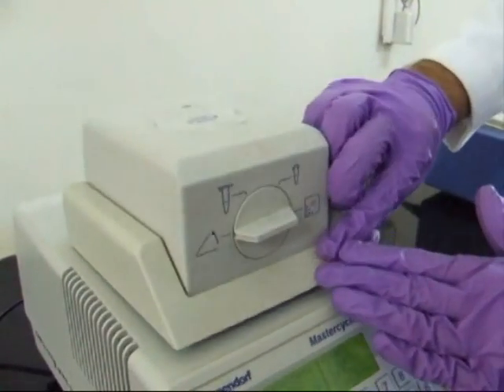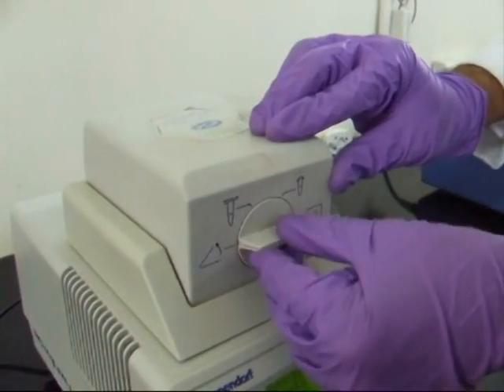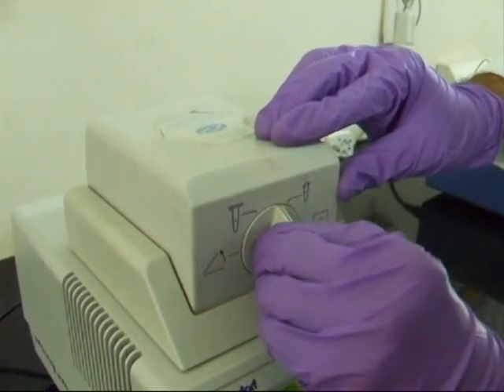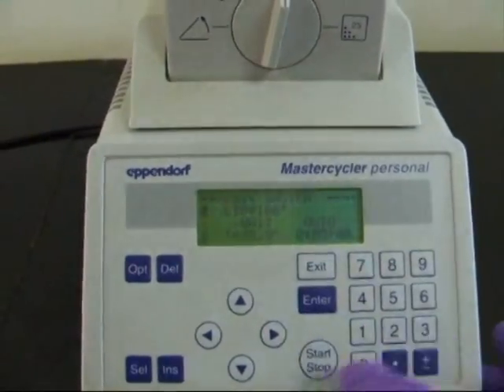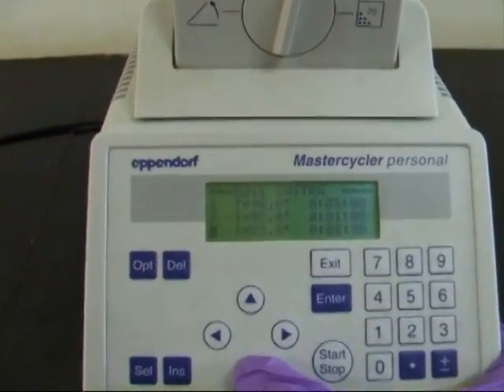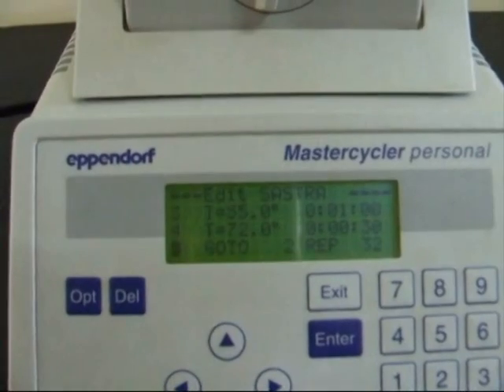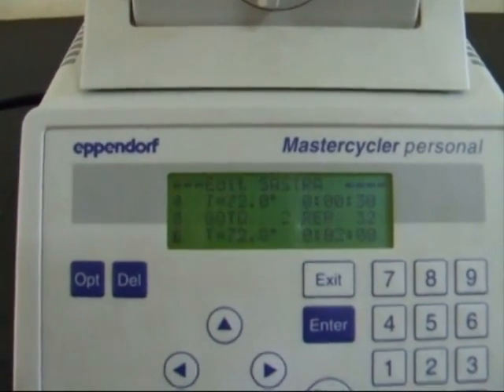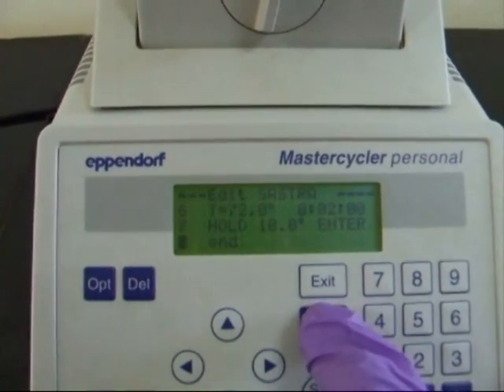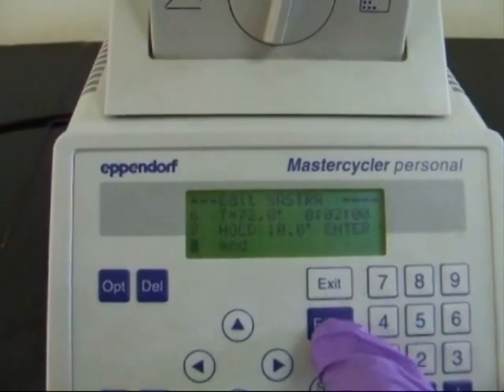Initial denaturation at 95 degrees centigrade for 5 minutes. Step 2, denaturation 95 degrees centigrade for 1 minute. Annealing at 55 degrees centigrade for 1 minute. Extension 72 degrees centigrade for 30 seconds. Go to step 2 and repeat the cycles for 30 times. Final extension 72 degrees centigrade for 2 minutes.